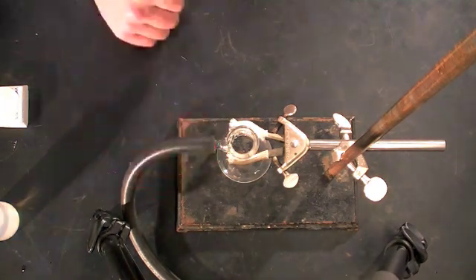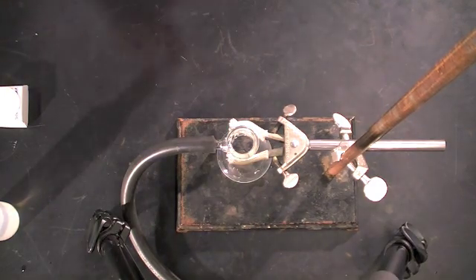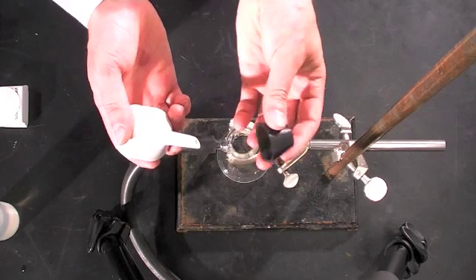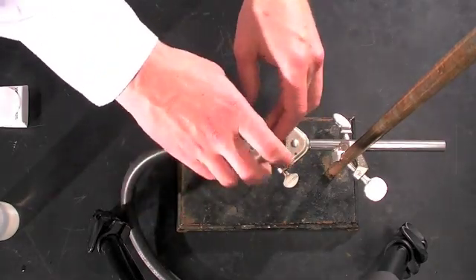This is your Buchner funnel. It has a little rubber washer that works to create a tight seal with the flask.